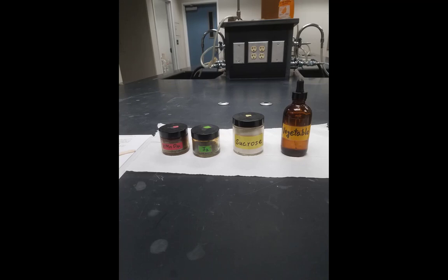Here we see the four different substances whose polarity we are going to evaluate. They are potassium permanganate, iodine, sucrose, which is table sugar, and vegetable oil.